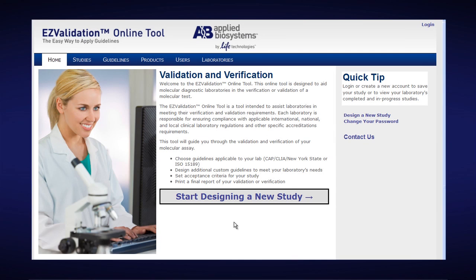Laboratory directors and personnel are able to select applicable standards, guidelines and enter user-defined acceptance criteria to customize verification and validation protocols for their specific application. We'll go through the first four easy steps to help you start designing a new molecular validation or verification study.